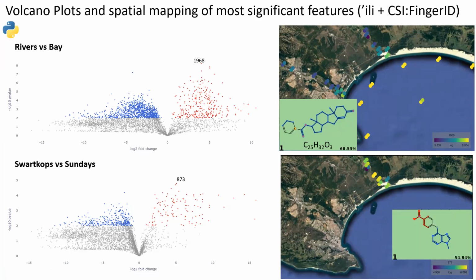And those that were incorrect, it was because SIRIUS had actually not been able to annotate the right molecular formula. That being said, my notion from that is, if you're able to annotate the molecular formula correctly, then CSI:FingerID can produce really good results in terms of structure prediction. So basically what that means to me moving forward is, as instruments get higher mass accuracy and higher isotope pattern fidelity, the utility of especially the in silico prediction tools is going to be a lot bigger.